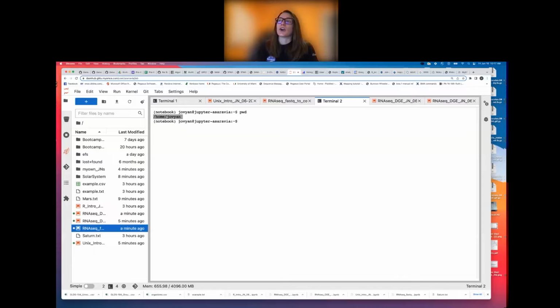If you're not in your home directory, can you guys put in some commands you could use to move into your home directory? If you're not already there, what are some commands you could use to move there on the terminal? Yeah, Mark, Ty, right. So cd tilde will get you there.